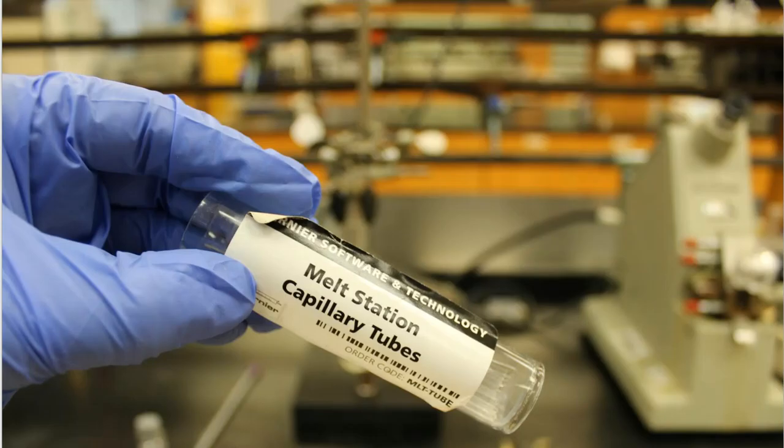All right, so in order for this to work, I also need those capillary tubes. These were the capillary tubes that we use in our melting point stations, whether it's the Vernier melting point or the MP50 melting point that we use in our lab. You know, the capillary tubes that are open on one end but closed on the other. I do not want TLC tubes. I don't want those types of capillary tubes because those are open on both sides. They need to suck liquid up. That's not what we need here. We need the closed melting point capillary tubes. It's very important. Otherwise, this thing's not going to work for me.